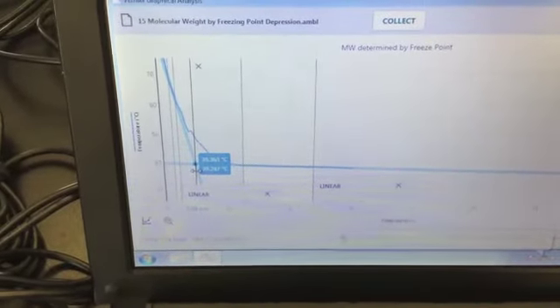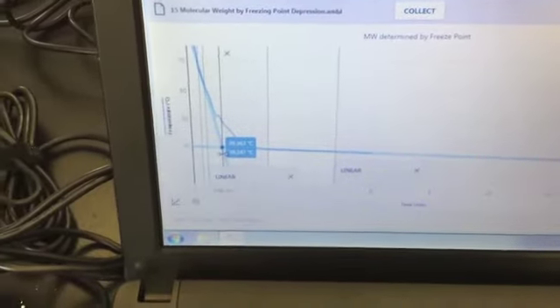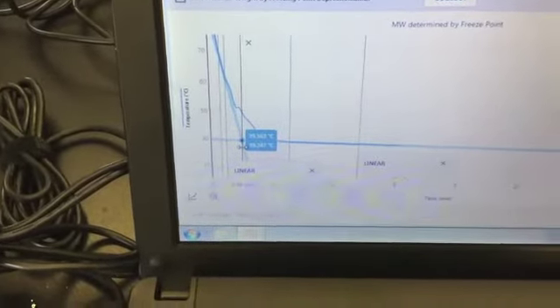So I'm going to call the melting point of this mixture 39.3 degrees Celsius. You may notice that I'm leaving off some of the decimal places. In actuality, my thermometer can't calculate all the way out to those decimal places.